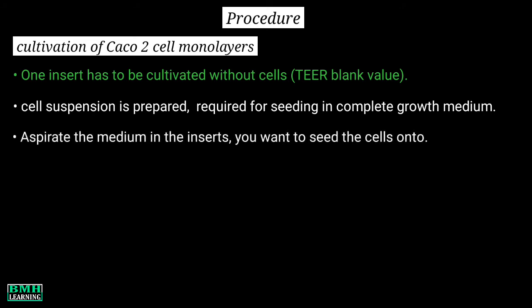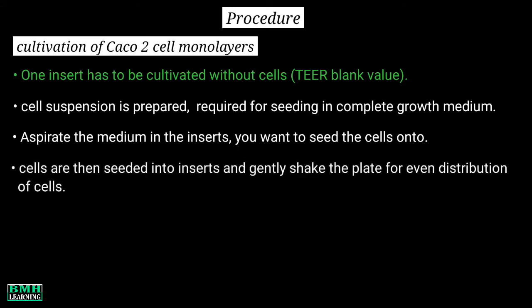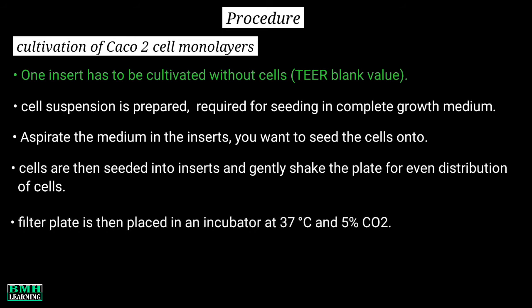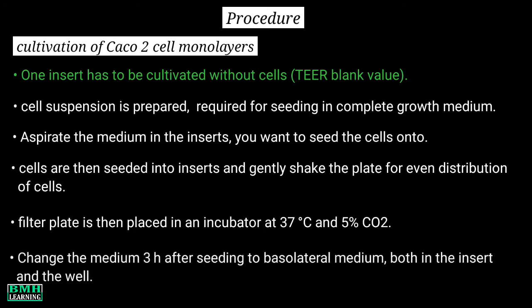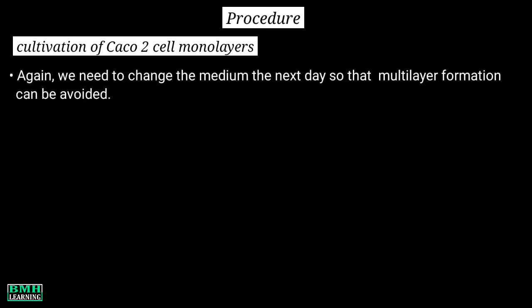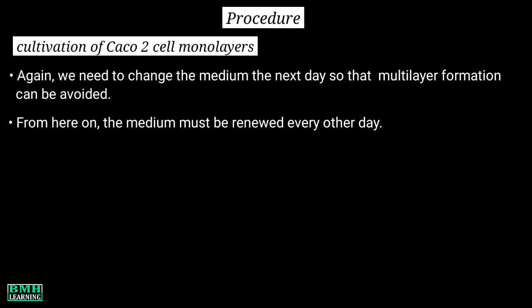Aspirate the medium in the inserts on which you want to seed the cells. The cells are then seeded into the inserts and the plate is gently shaken for even distribution of cells. The filter plate is then placed in an incubator at 37°C and 5% CO2. Change the medium 3 hours after seeding to basolateral medium, both in the insert and the well. Change the medium again the next day to avoid multi-layer formation. From here on, the medium must be renewed every other day, three times per week, until the end of the cultivation period, which is around 19 to 21 days.